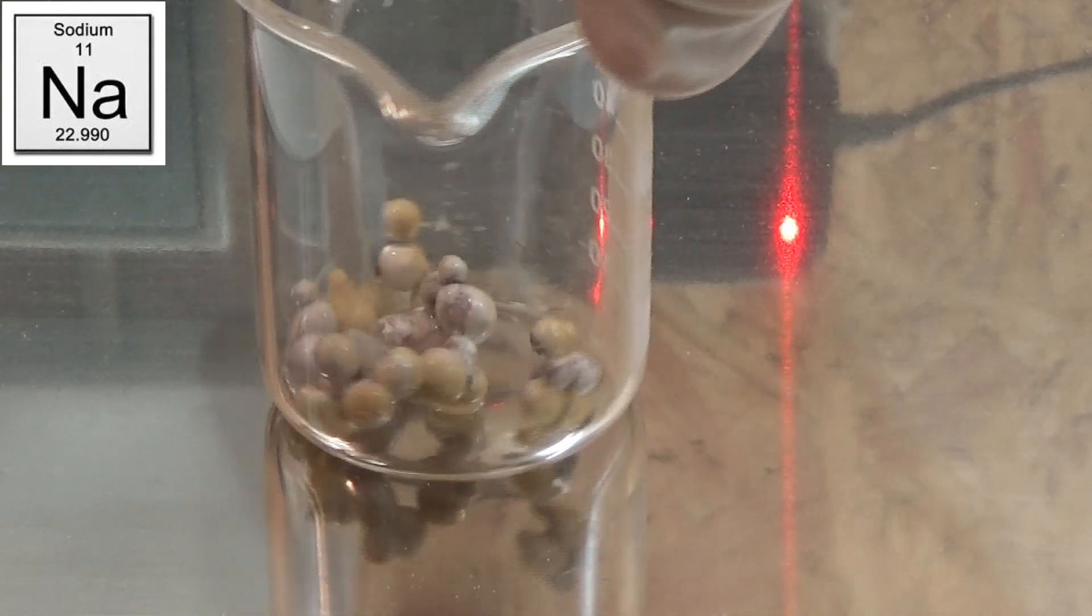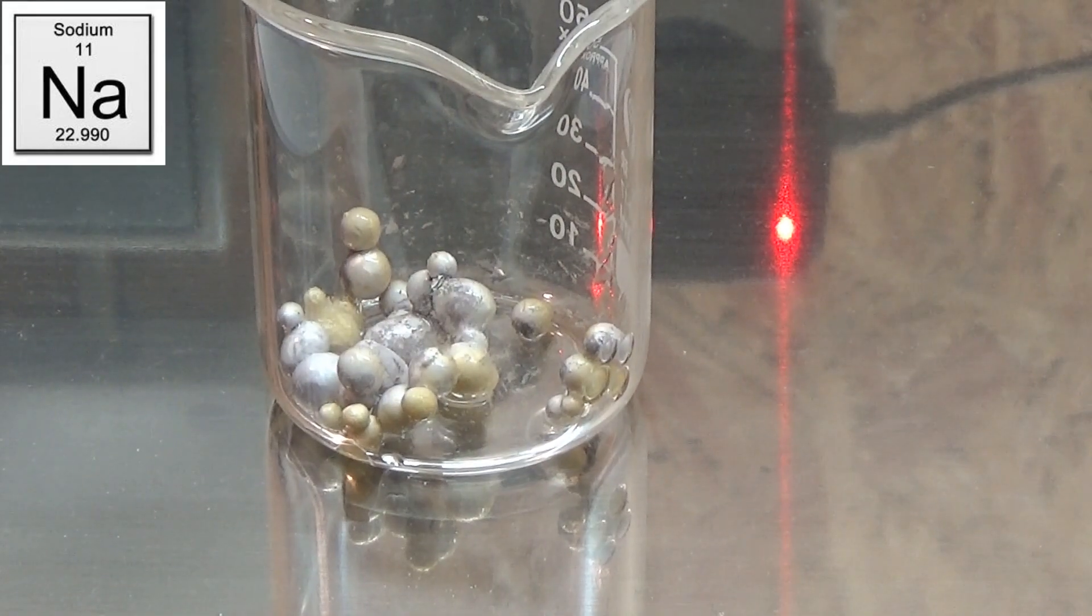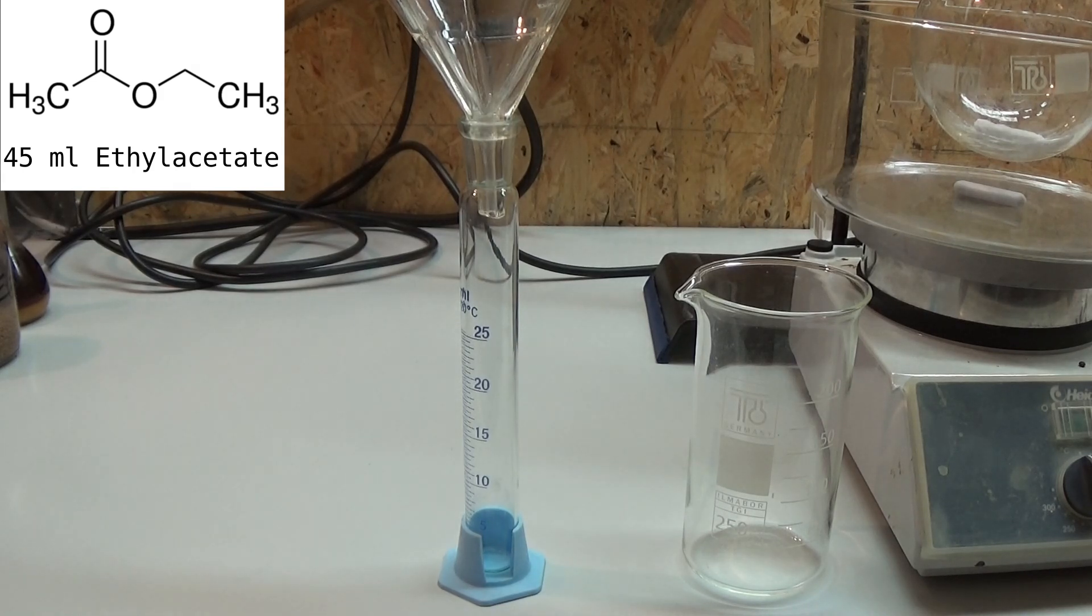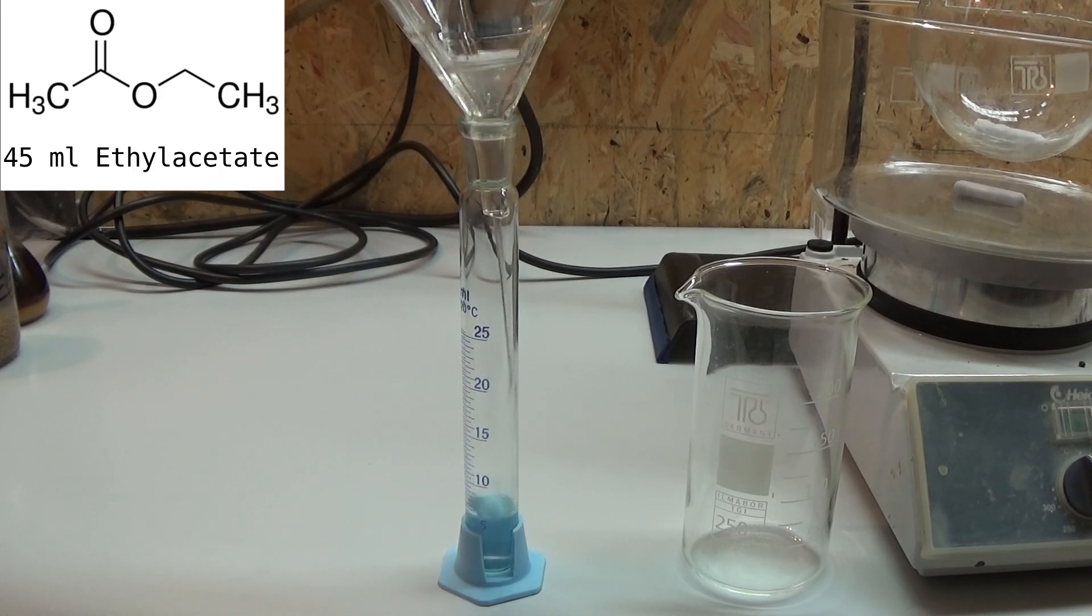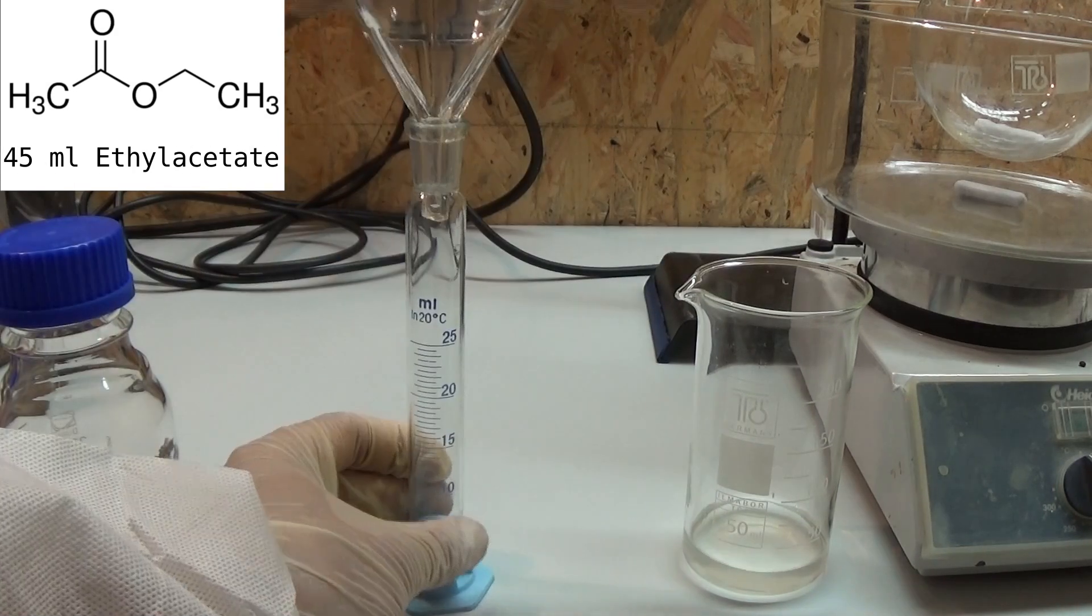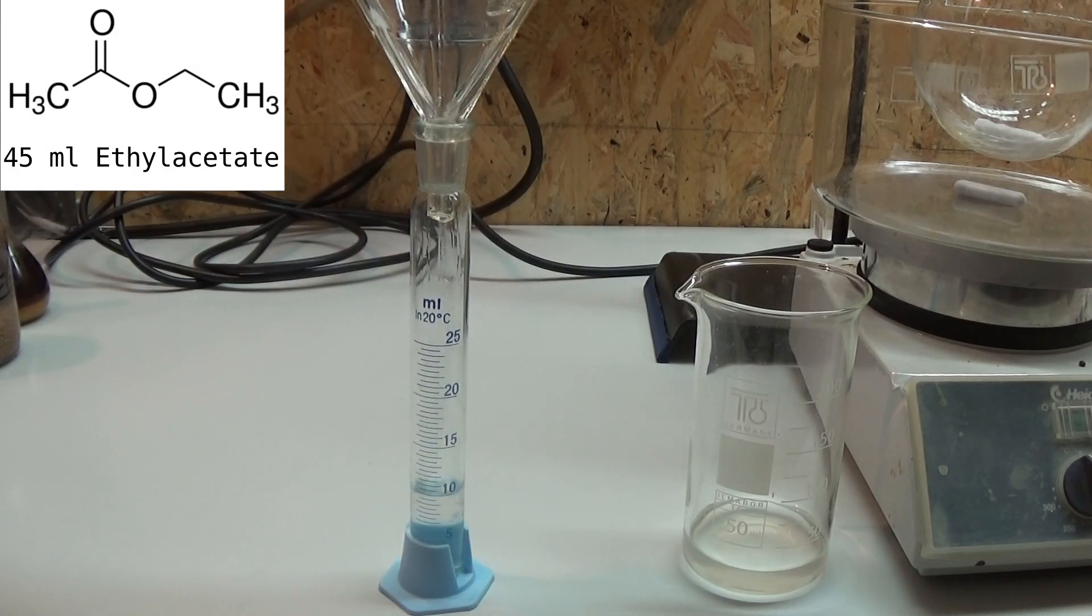Next up we measure out 45 milliliters of absolutely dry ethyl acetate. It is important that the ethyl acetate is 100% dry because of the sodium we are using. If there is any water left in our reactants it will react with the sodium forming sodium hydroxide which could potentially start side reactions and decrease the yield.